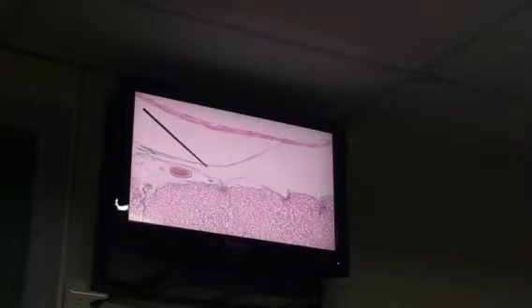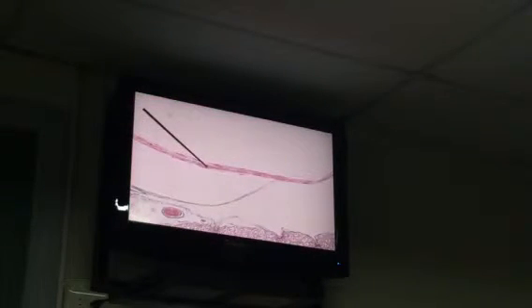Let's move on to your spinal cord. Spinal cord is number 90. So this is spinal cord under scanner. And this time we can easily see your meninges. Okay. So this is the outermost meninges, that is dura.